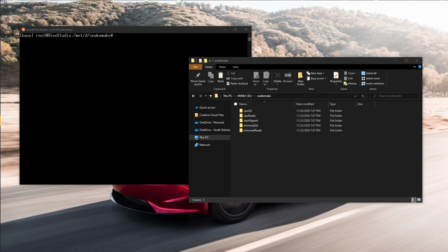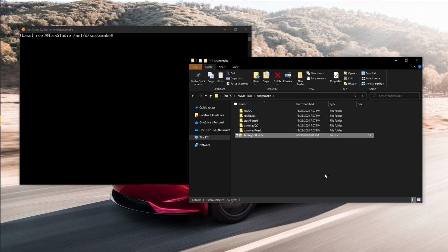In addition to that, for raw QC we don't really need anything extra. For trimming, we need that adapter file. When we were looking before for our adapter file, that's in the miniconda folder in the home directory of Linux, and not on the Windows side, but you can find it in the Windows side if you really wanted to dig for it in the root fs for Ubuntu. Anyway, so we have our adapter file. So now we can do trimming, QC, and raw QC.